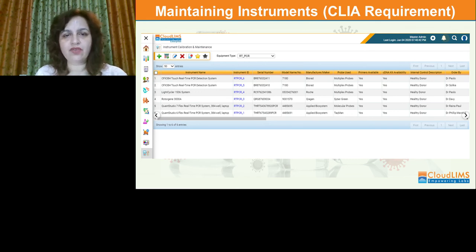It keeps track of the technician responsible for the equipment. It maintains the date on which the maintenance took place and schedules upcoming maintenance and calibration dates. The lab manager receives a reminder ahead of time so that lab activities can be scheduled around maintenance days. You can also add purchase information such as model name and number, serial number, warranty period, purchase date, and the vendor contact information.